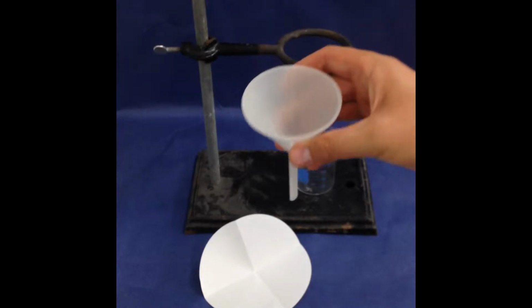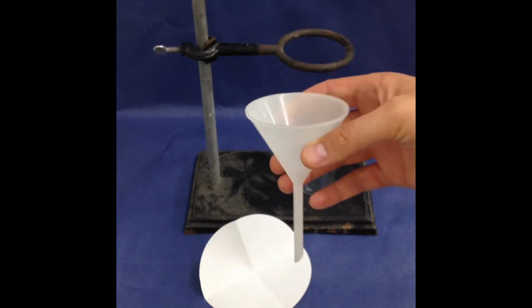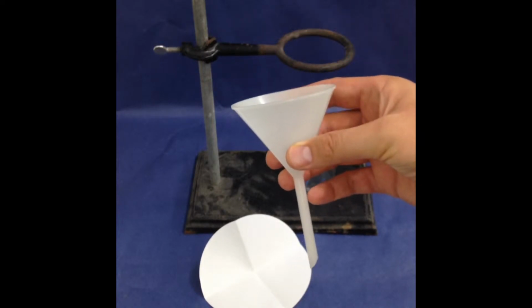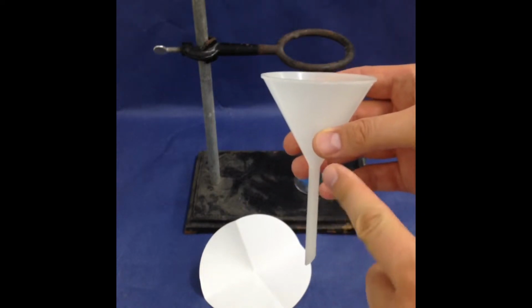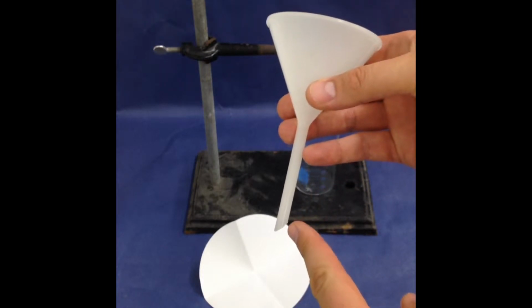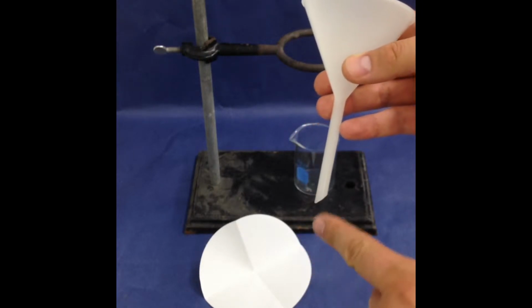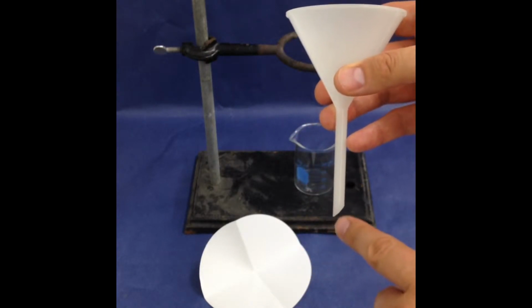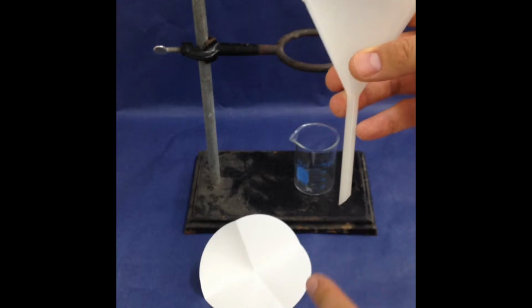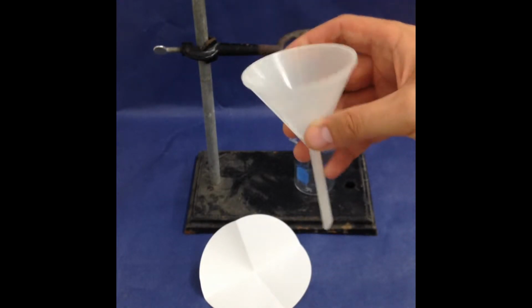In this video, I'm going to show you the funnel and how it's typically used in science. You can see the funnel has a conical shape here, and it's got a little stem for the liquid to pass through. You can also see that it was cut at an angle here, and that's special for allowing the liquid to make contact with the inside of a beaker or a test tube. Kind of helps the liquid come out.